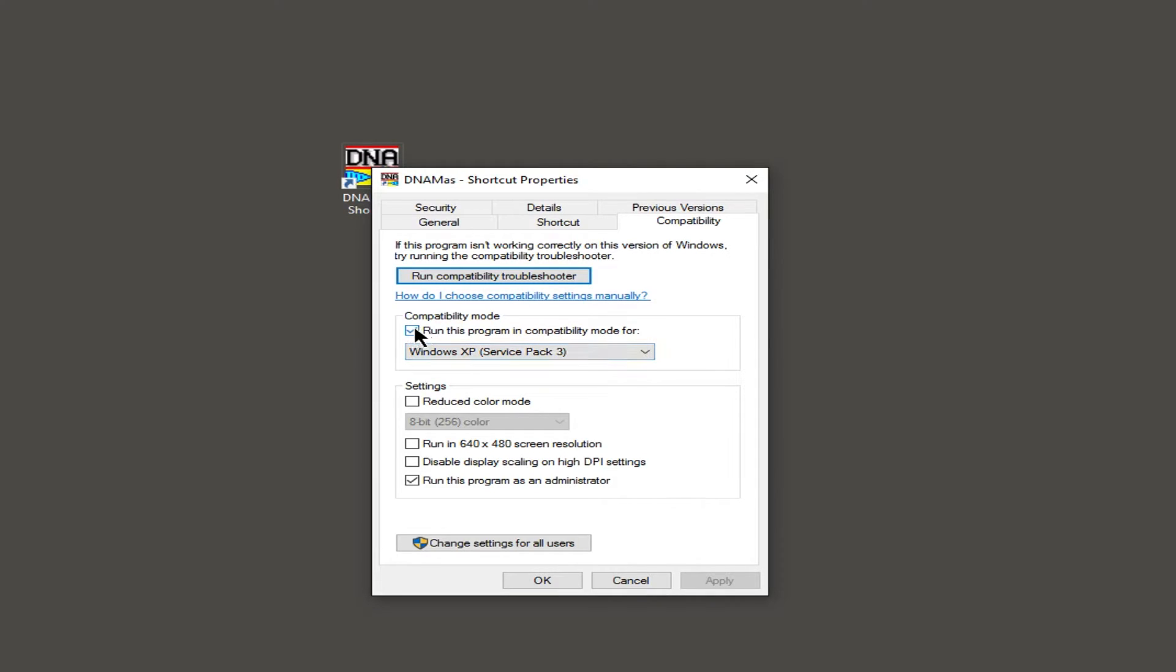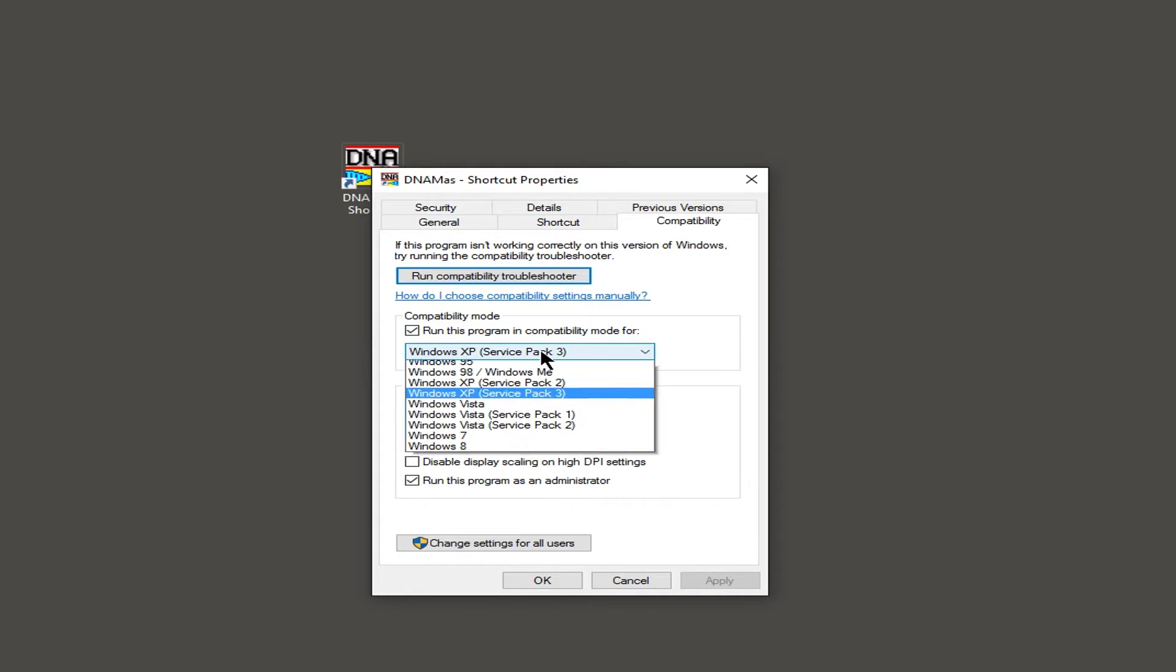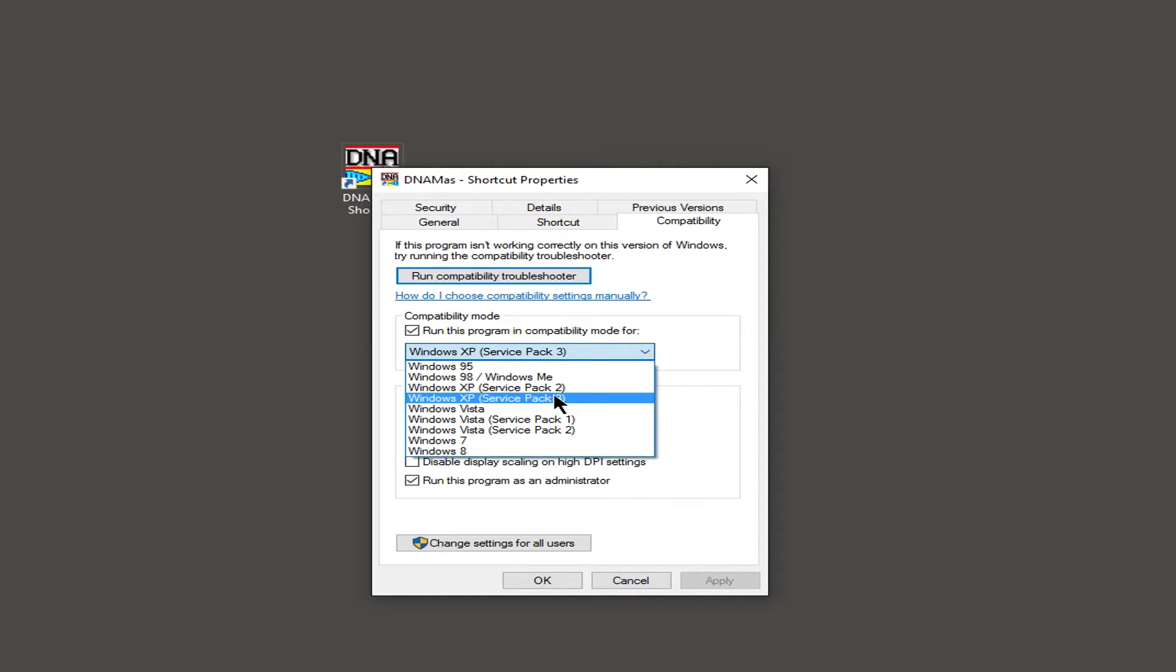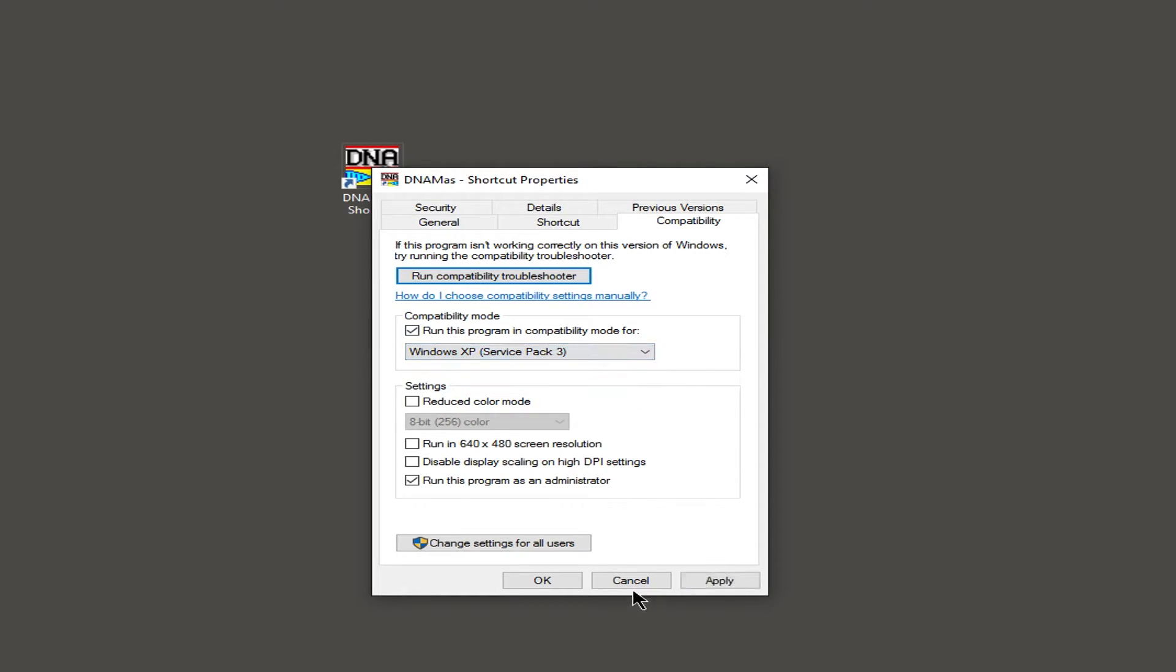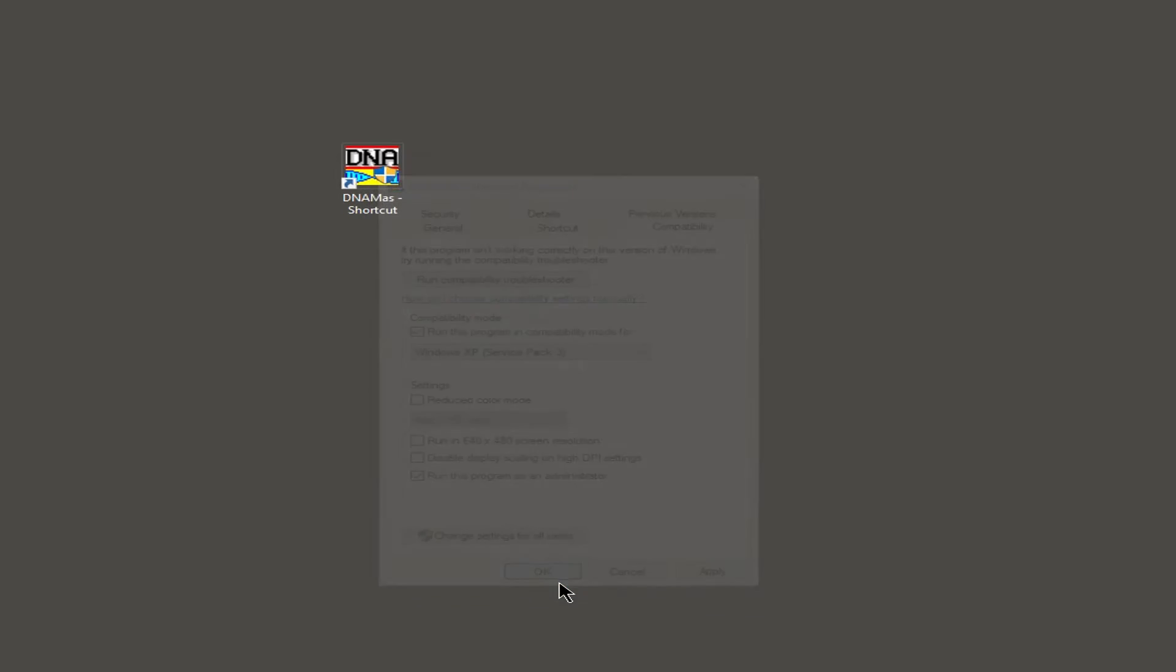Also, you want to have this compatibility mode here, run this program in compatibility mode for Windows XP Service Pack 3. So you're going to hit that, and just click OK.